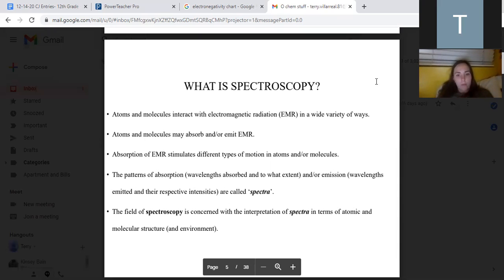And so after we do this, it's going to cause some type of change or effect. And our instrument will detect that. And it's going to produce something called the spectrum, singular, or spectra, plural. So basically, yeah, this is wrong. It should be spectrum.